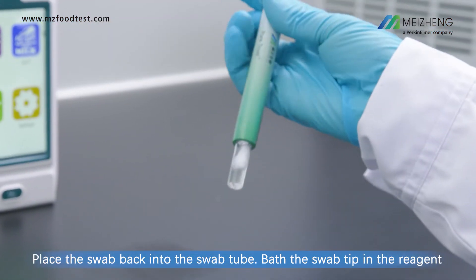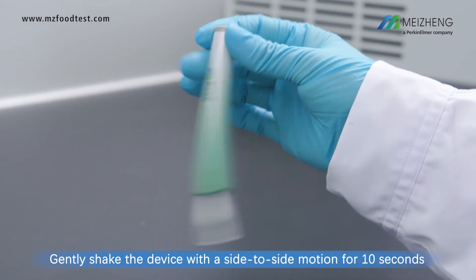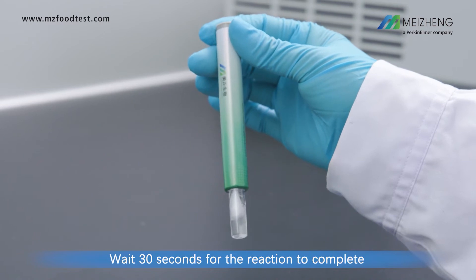Bathe the swab tip in the reagent. Gently shake the device with a side-to-side motion for 10 seconds. Wait 30 seconds for the reaction to complete.